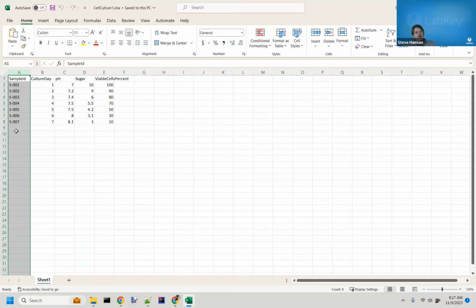And so there's probably a missing piece here, which is, don't you want to record the biobag, the incubator, as one thing? It's not changing. There's some expression or some biobag which has one ID. Don't we want to capture that? Well, we are going to capture that. We're going to capture it in a run field. We're going to capture a whole bunch of stuff in the run fields, stuff that isn't really here in the results fields.